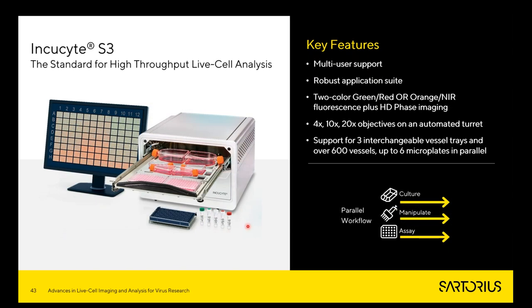An upgrade to this system is the Incucyte S3. The Incucyte S3 is a step up in terms of throughput because we can image up to six plates in parallel, and it also allows for multi-user support using user-defined schedules, because here the objectives sit on an automated turret.